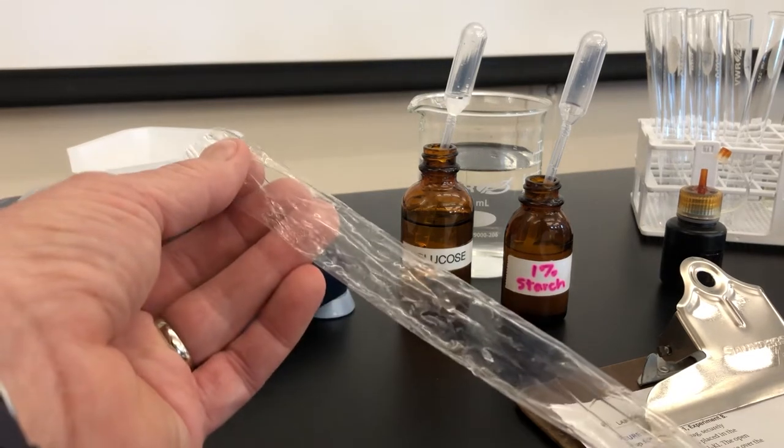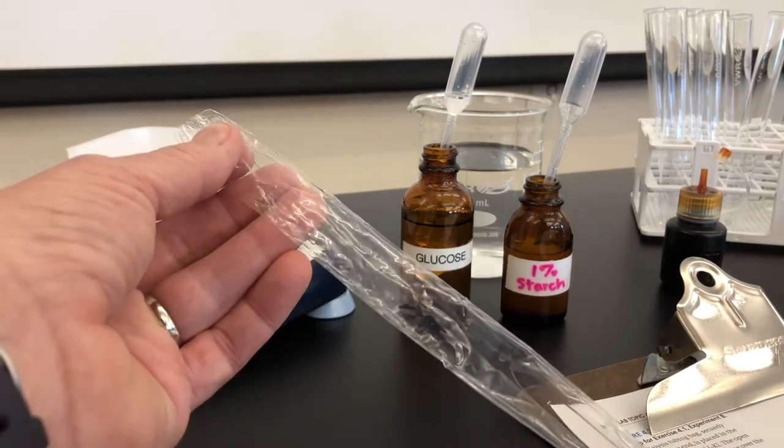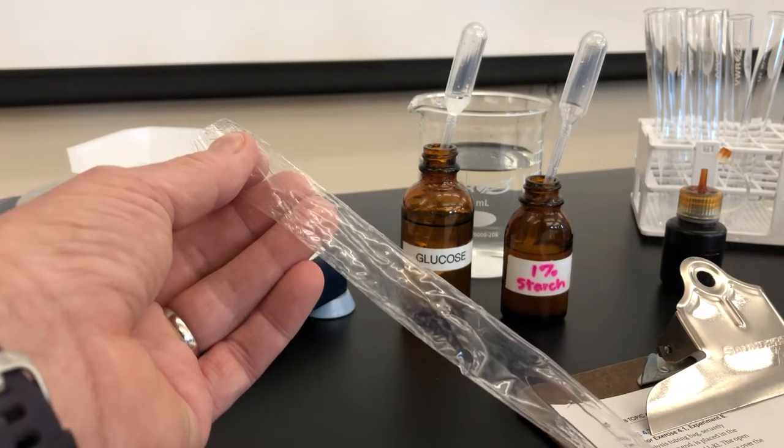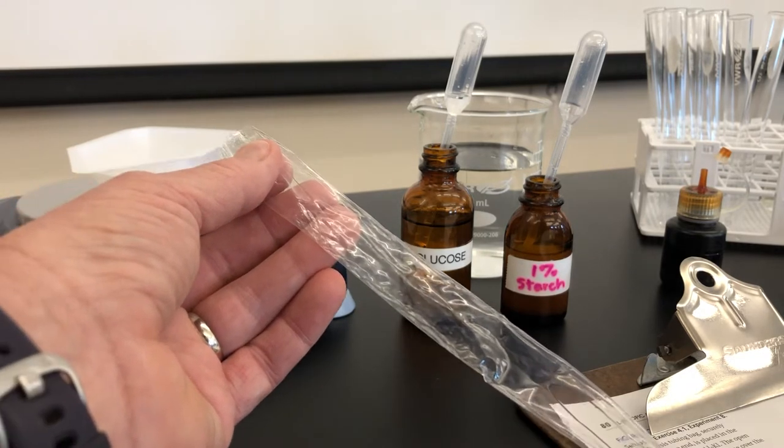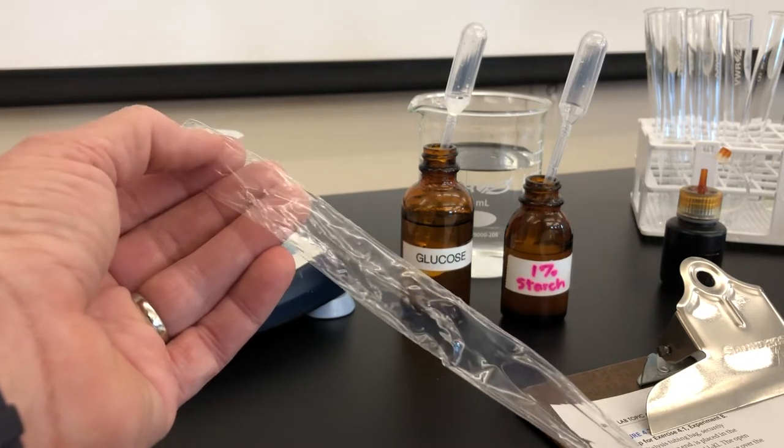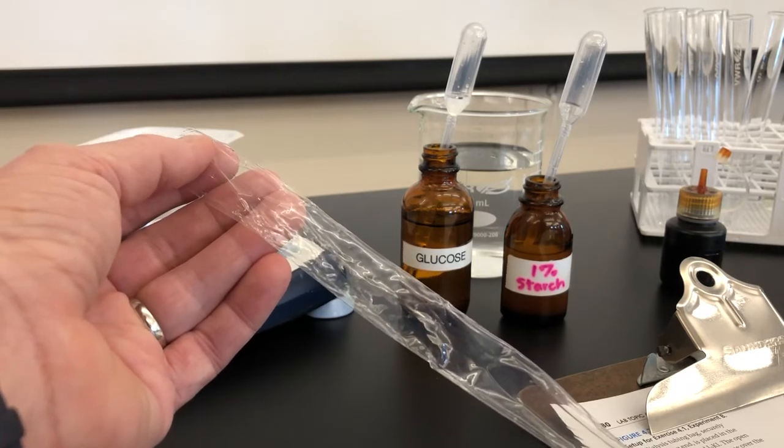It is a membrane so it has fine pores that allow some things in. This selectively permeable membrane is useful for testing for diffusion in osmosis.